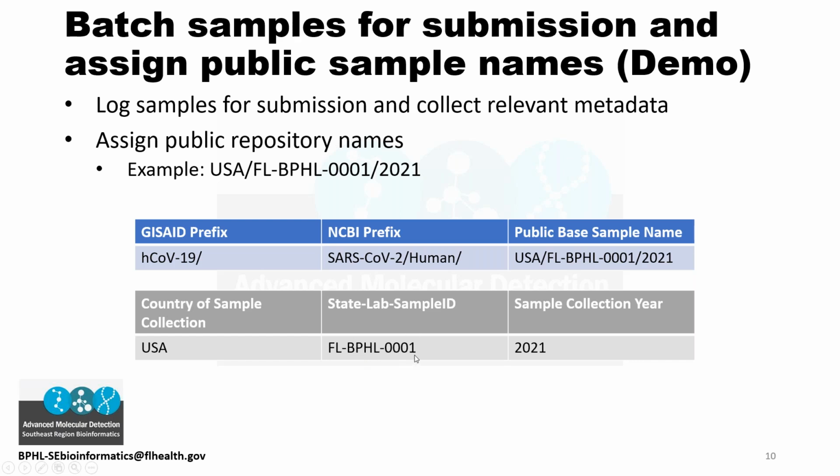The next number there is either your sample ID, sample number, whatever you want. With CDC's sample IDs, you'll notice they do it based on all their different contract labs. So all the Quest Diagnostics samples start with QDX, LabCorp, I think, is LC, and then a number. Here in Florida, I'll show you how we rename ours. We just start with 1 and keep on going. That also gives us an indication of how many samples we had submitted.